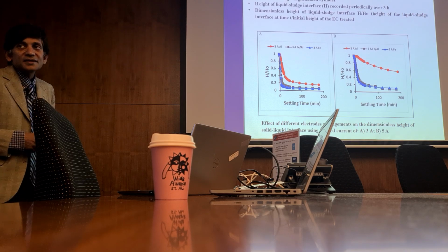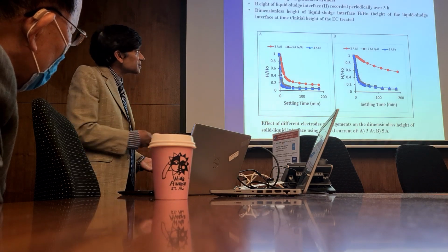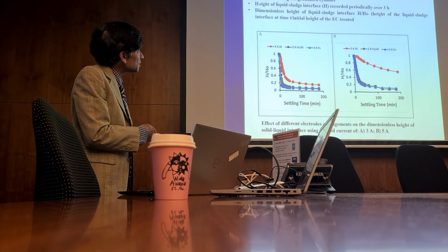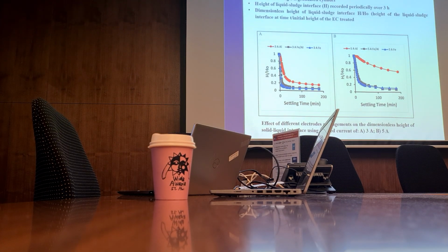The main point here is that actually the metal ion we use is very important. Aluminium leads to more open flocks, and they take much longer to settle, as you can see from the red line. If you use iron, given by the blue, they settle much more quickly. The other point, I think it's well known, is that if you use too much flocculant, you can restabilize everything.